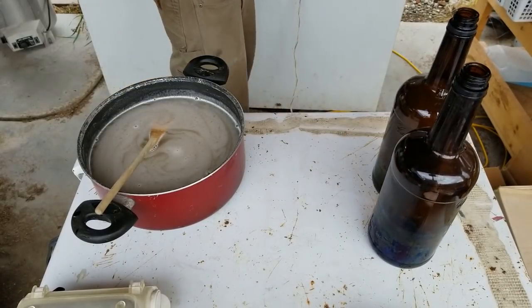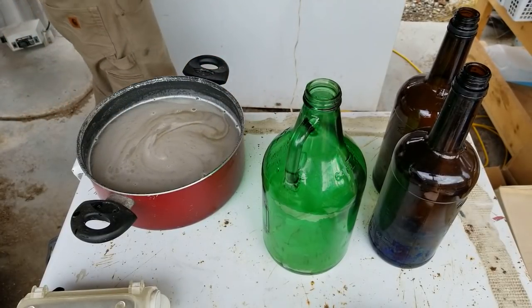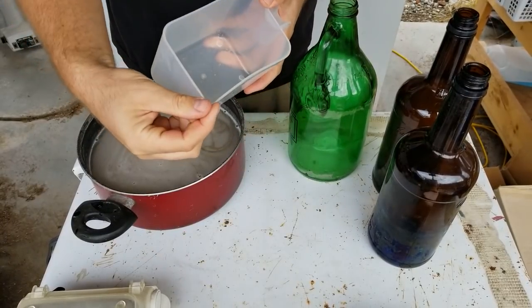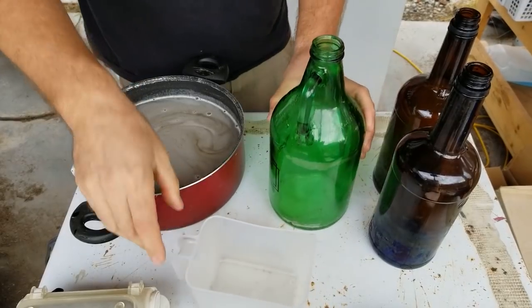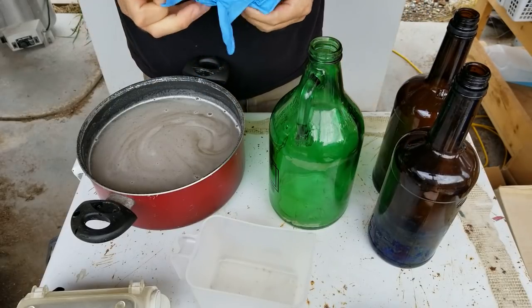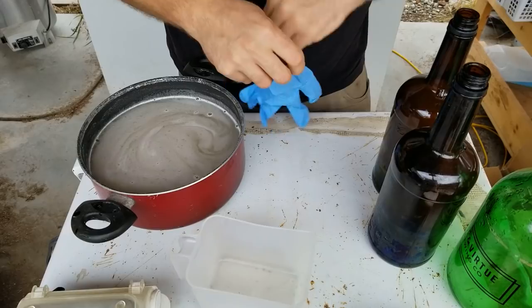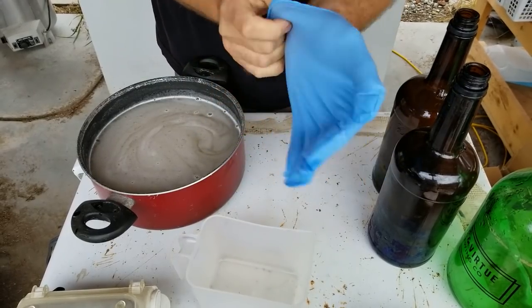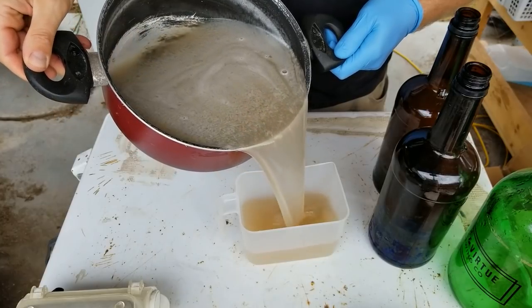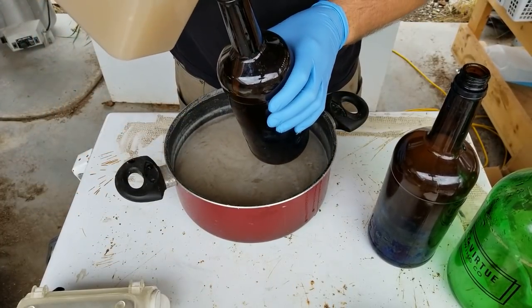Next we're ready to pour our agar solution into the whiskey bottles — and in this case I have one growler bottle as well. I want to mix the solution evenly in the bottles and I'm going to use this container that has a spout on it; it's really great for pouring agar. Really important: put a glove on the hand that you're going to hold the bottle. The bottle is going to get hot because the agar is hot, and if any agar drips down the bottle onto your hand the glove will protect that. I'm just going to pour this agar solution evenly between the three bottles, pouring over my pot in case there are any spills.